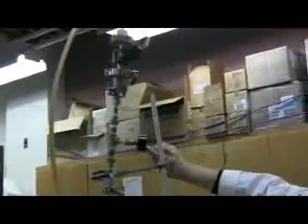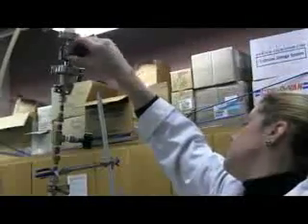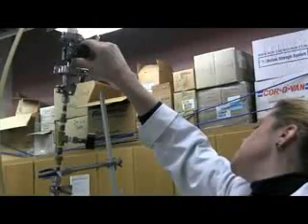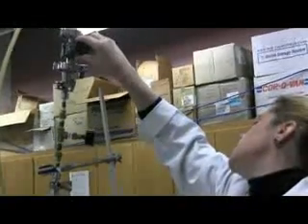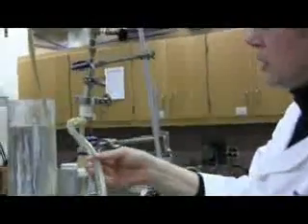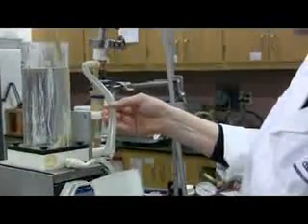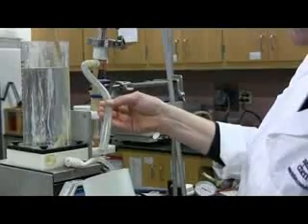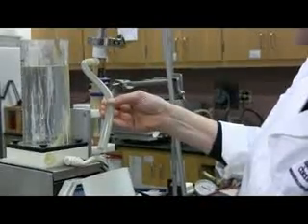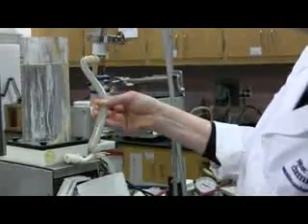All right. But now watch. If I close the valve, I can read here that the pressure is now about 4 psi. If I close the valve more, let's say I get the pressure at about 6 psi. There it is, 6 psi. Okay, so now let's see what the permeate flow looks like. This is artificially fast because we've got to drain the tube first. So once the tube is drained, we're reaching the point where we can follow how much is actually coming out of here. So we can measure this flow rate, and that will be at 6 psi.